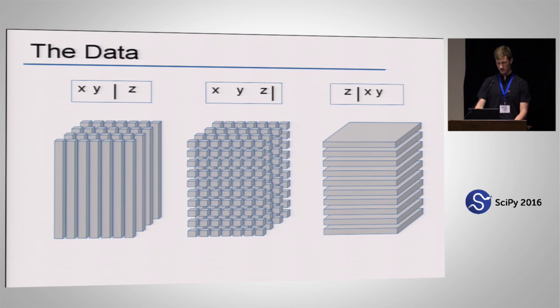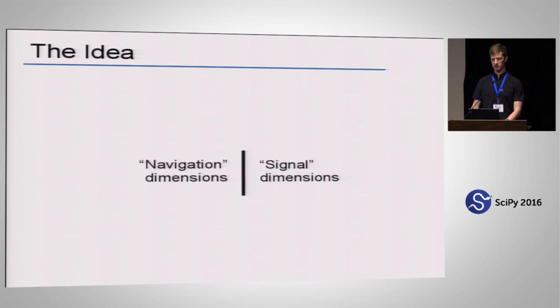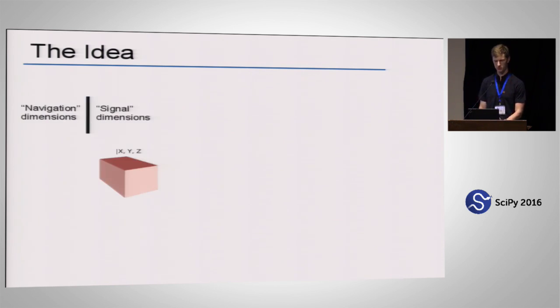So that hopefully essentially captured the whole idea of HyperSpy. What we just did here was we drew the line in our minds separating some dimensions as being the important ones and the others as being less important, that you only iterate over, that you select certain parts. And that's the idea of HyperSpy, to separate the overall dimensions of the array into signal dimensions and navigation dimensions or spaces.